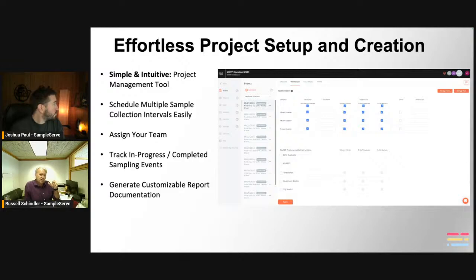If you've got a weekly schedule, you'll set up a separate weekly function where you're going to collect different samples on a weekly basis. If you've got things you need to do daily, you can set them up so that it automatically sets up that schedule daily. And everything is going to be very neatly organized, the daily stuff, the weekly stuff. Not that you can't do them both simultaneously. If it's a weekly event and you decide to go out and do both the weekly and the daily, you'll be able to combine those as well. It just makes it real simple to keep things scheduled and organized.